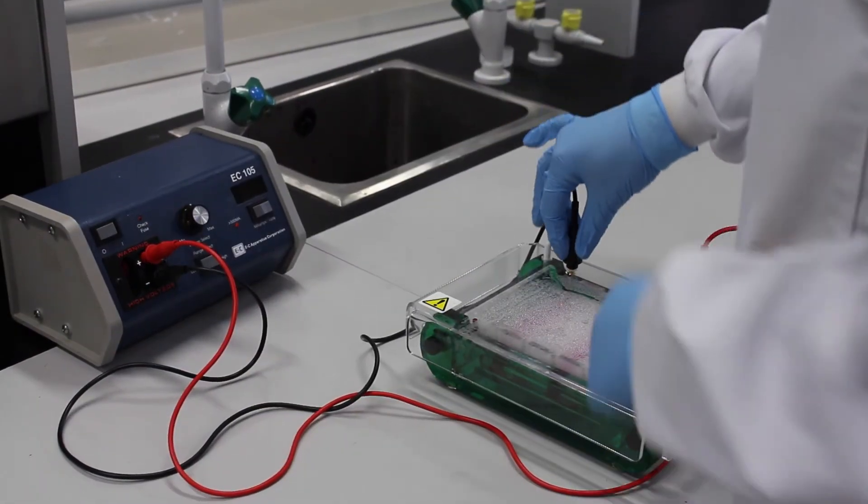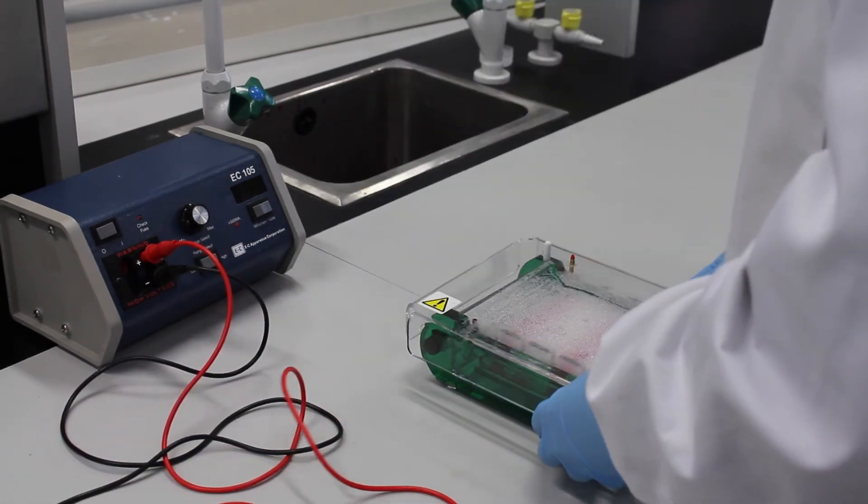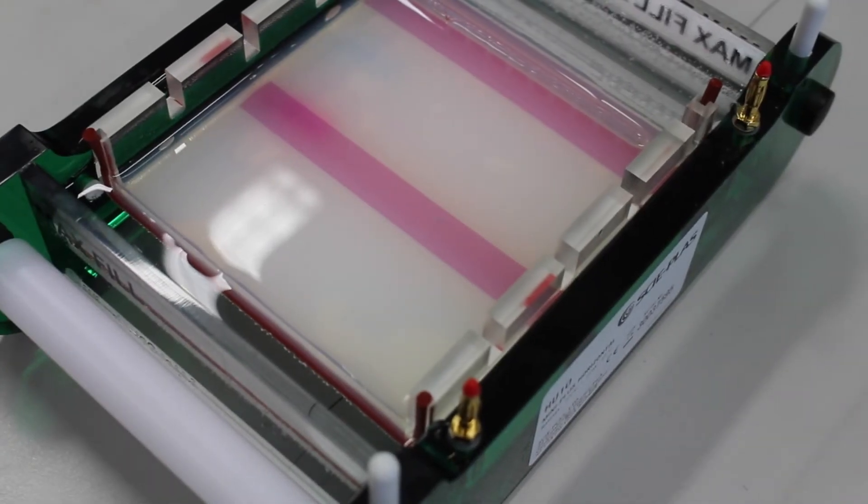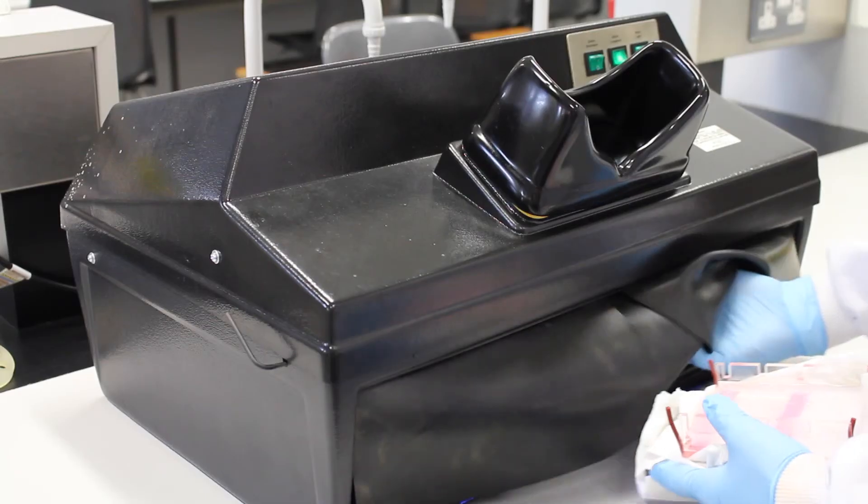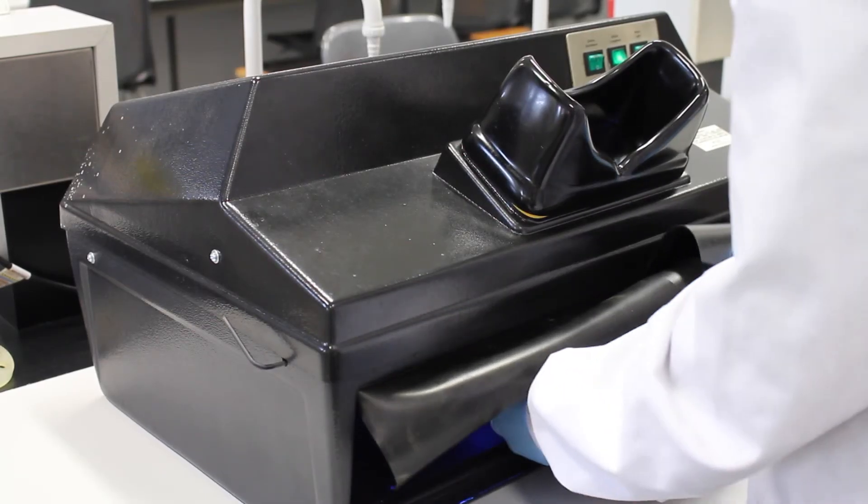When the gel has run, it's important to make sure to turn off the electricity supply before removing the electrodes. The gel is carefully removed while it is still in its mold and transferred to a source of UV light. A picture of the gel is taken.